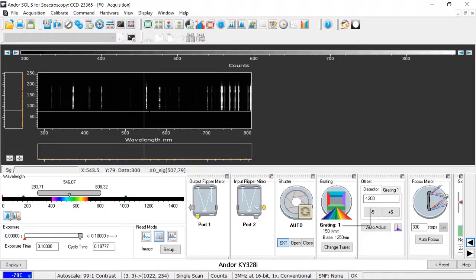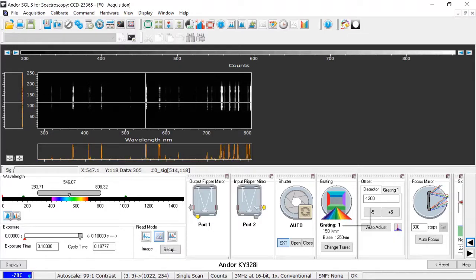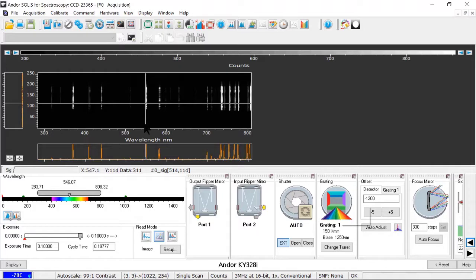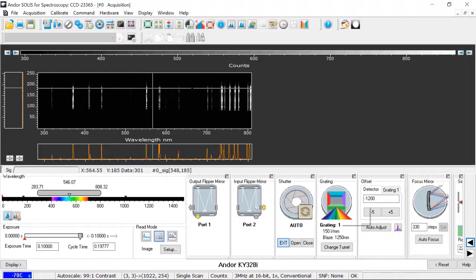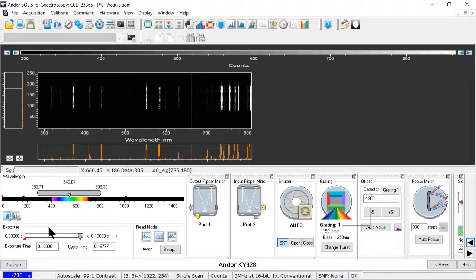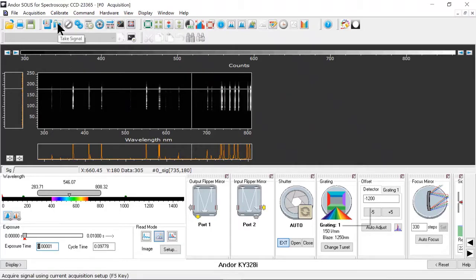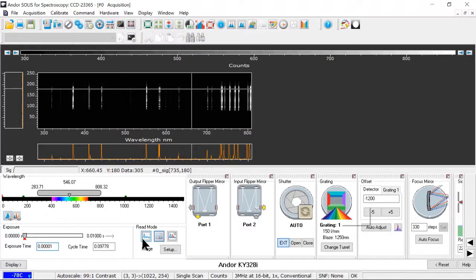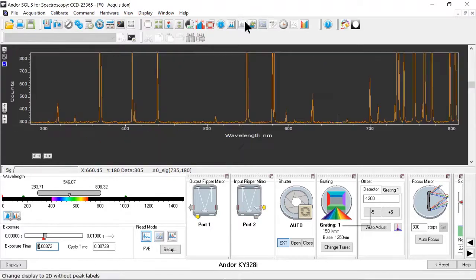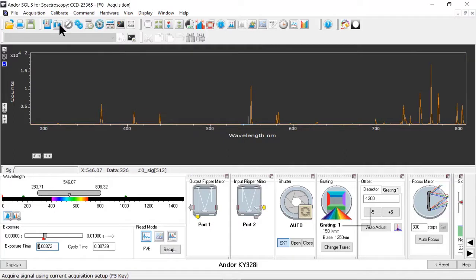And I'm collecting all that spatial information. Although the light coming into each one of these cores from the calibration lamp is from the same source, I could potentially have each one of these cores going to a different point in my experiment. And now that I've taken the image, I can show the FVB mode. So it's going to be like an image. But instead of capturing each individual pixel, I'm going to be capturing columns. So this column will get added up. This column will get added up. And I'll get one spectrum that's all added together at the end. Of course, there's going to be much more signal in any one individual channel, so I can drop my exposure time by quite a bit at that point. So let's see if I don't saturate at a very low exposure time. Switch that to FVB readout mode and to a spectrum view. And I have a spectrum.